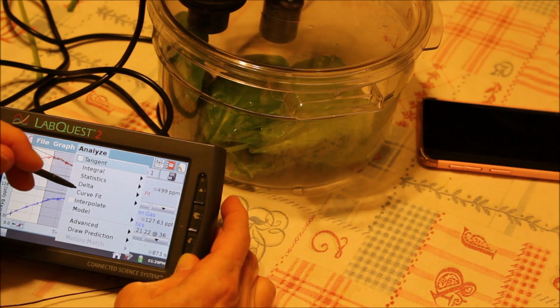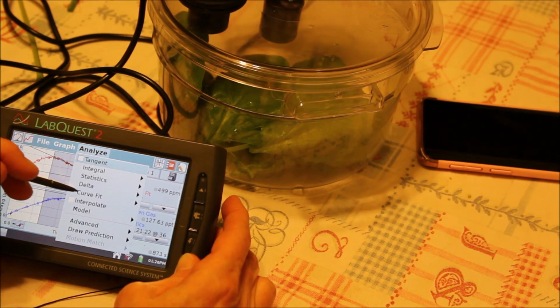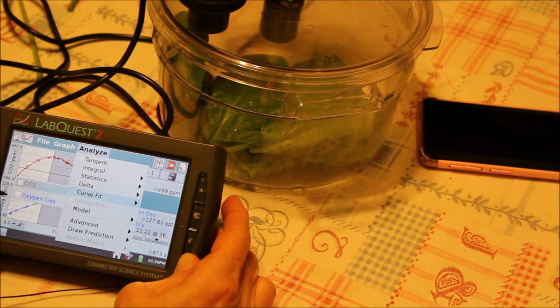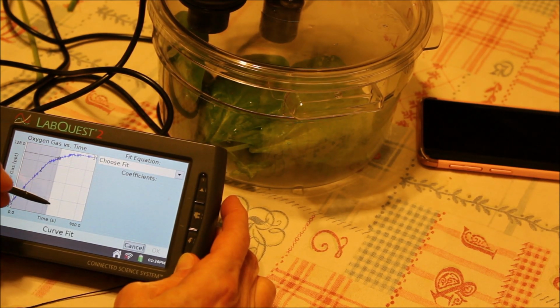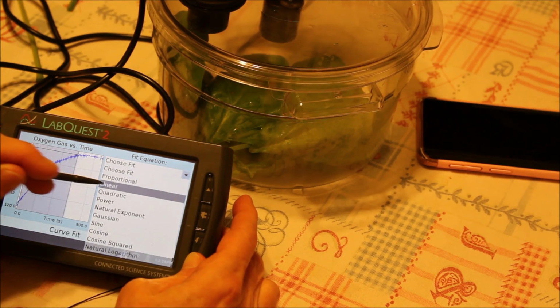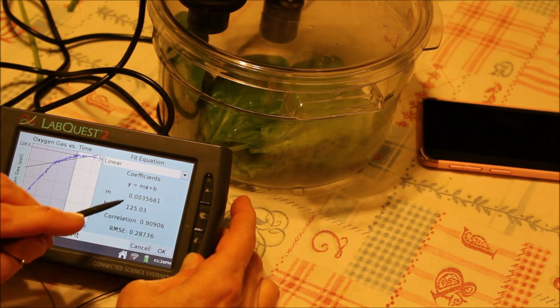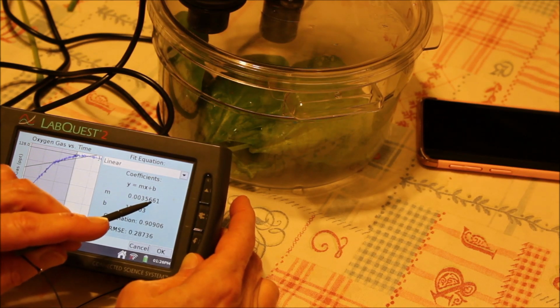You go again, analyze, curve fit, you X the carbon dioxide, analyze, curve fit again. Okay, it's the oxygen. I will do the curve fit from the beginning up till it goes to the top, pretty much, and you go curve fit, linear, we assume it's linear, up till here, and the coefficient, the rate, is 0.0035661.